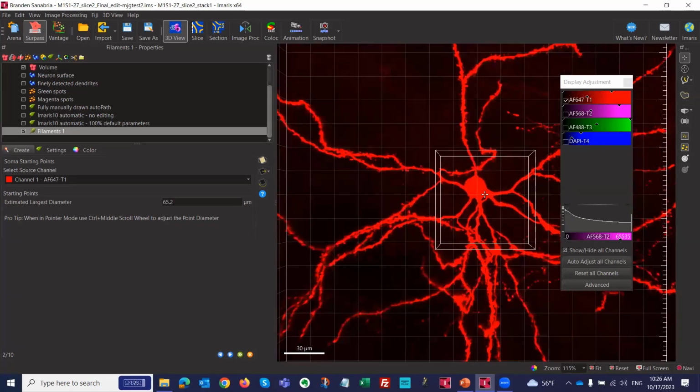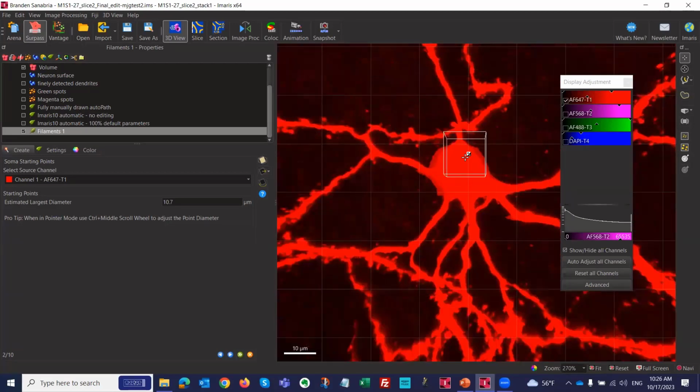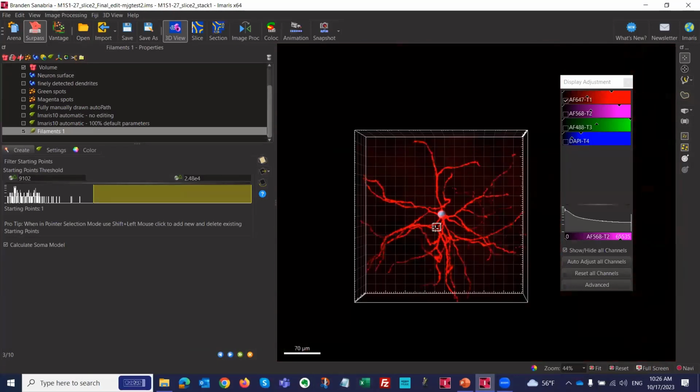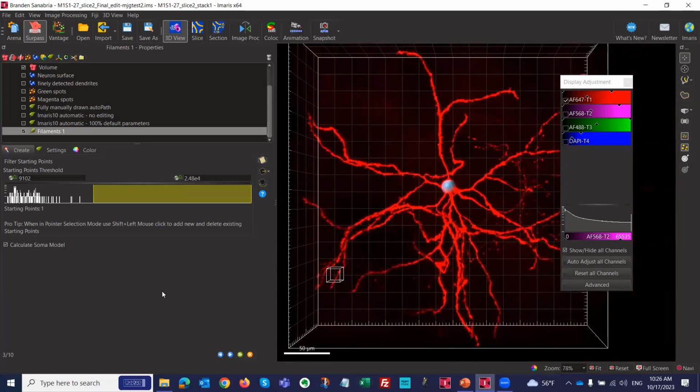And then I just zoom in here. I just say approximate size of this guy like this is 15.6. Okay. It's an approximation. It is not a magic number. If you do 15 or if you do 18 or something, it's all good numbers. Okay. Just a starting range. So if we go to the next step here, you can see it placed the starting point here, and there's only one. So it did a good job, one starting point.